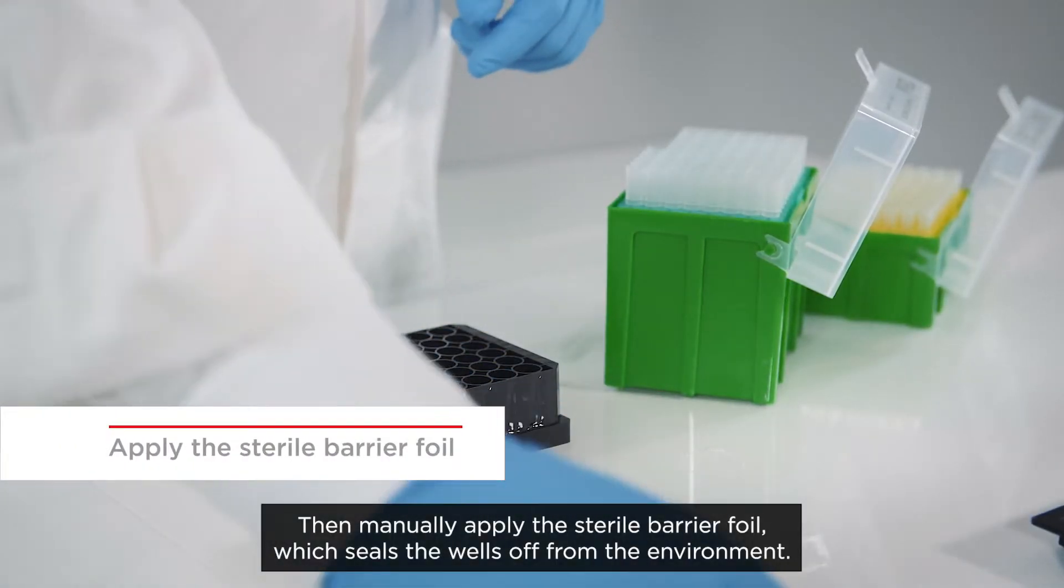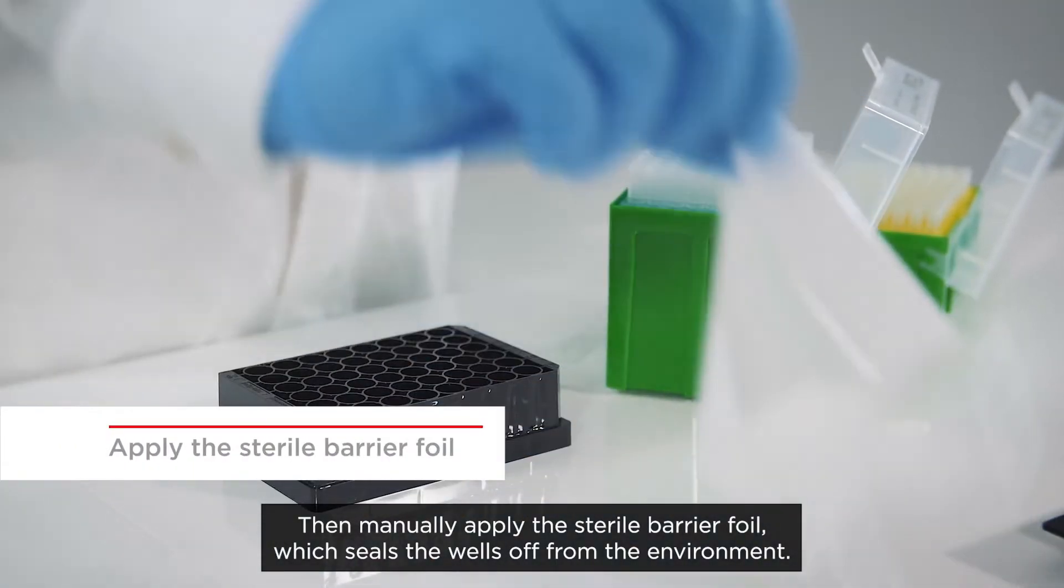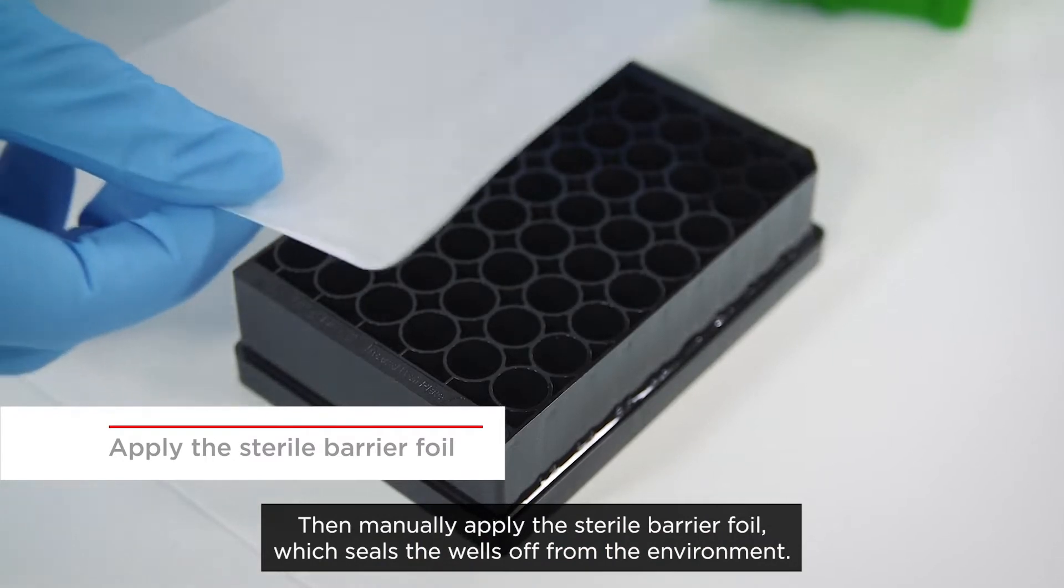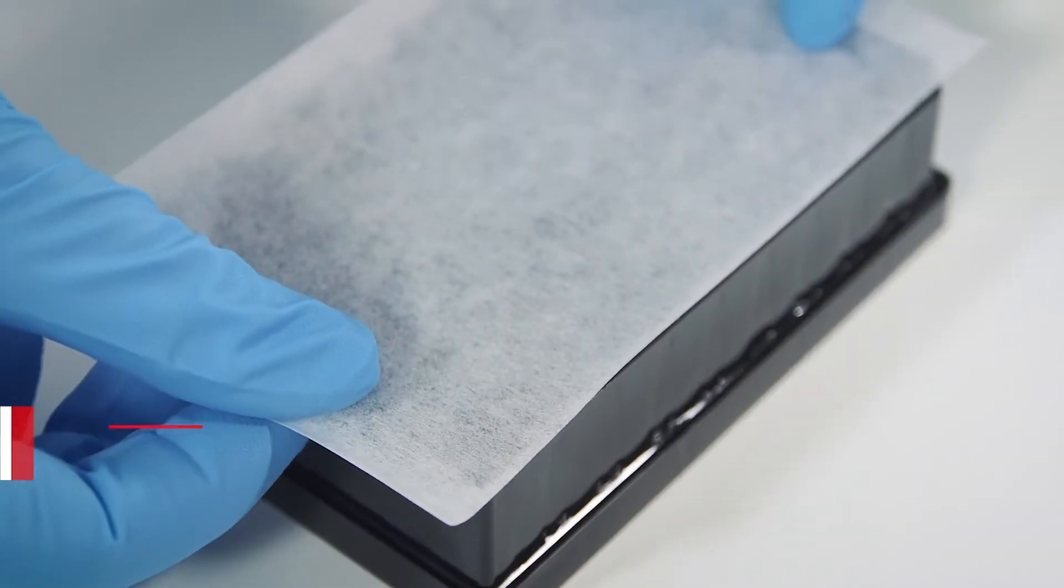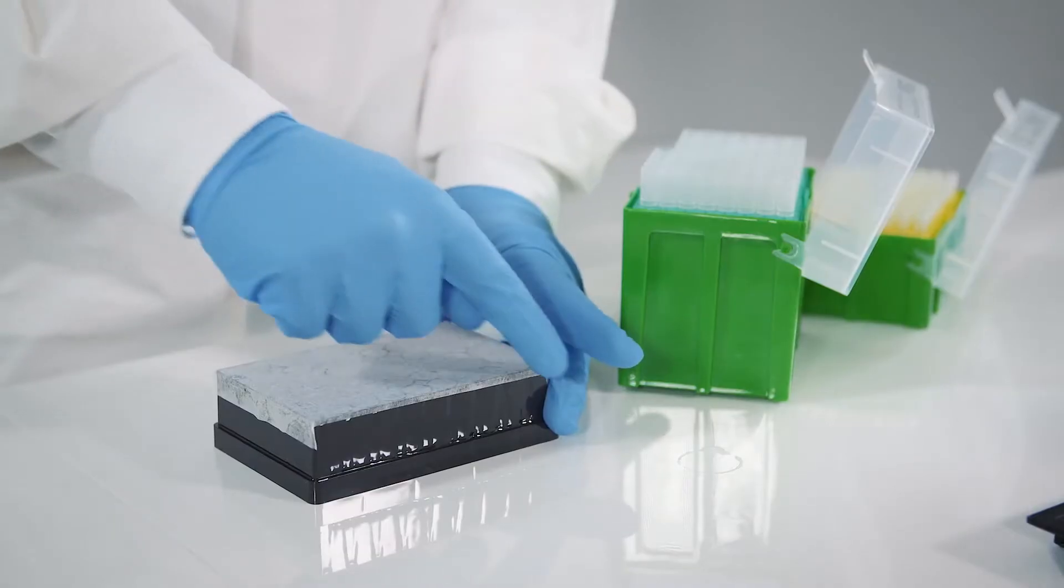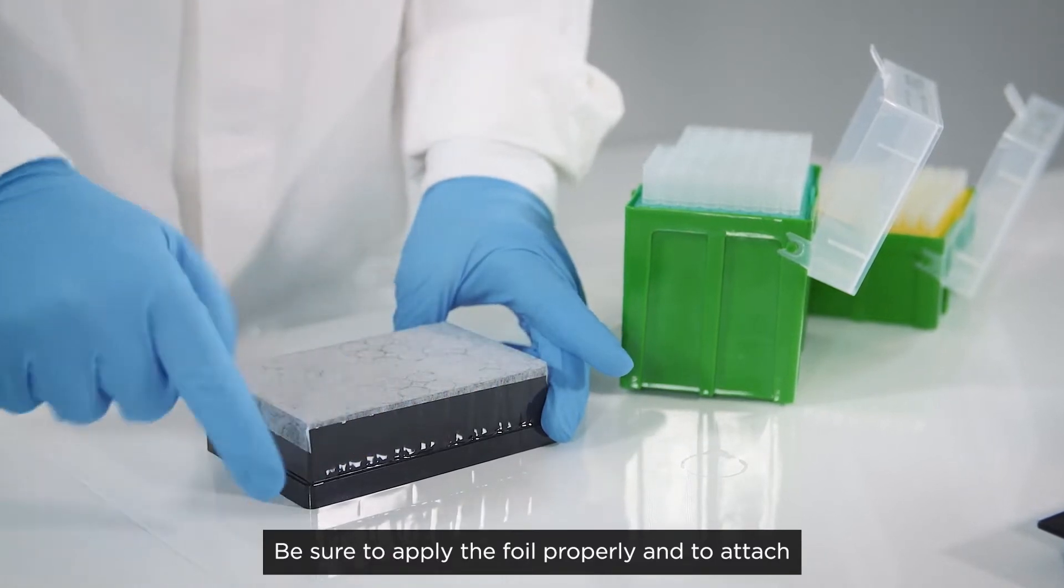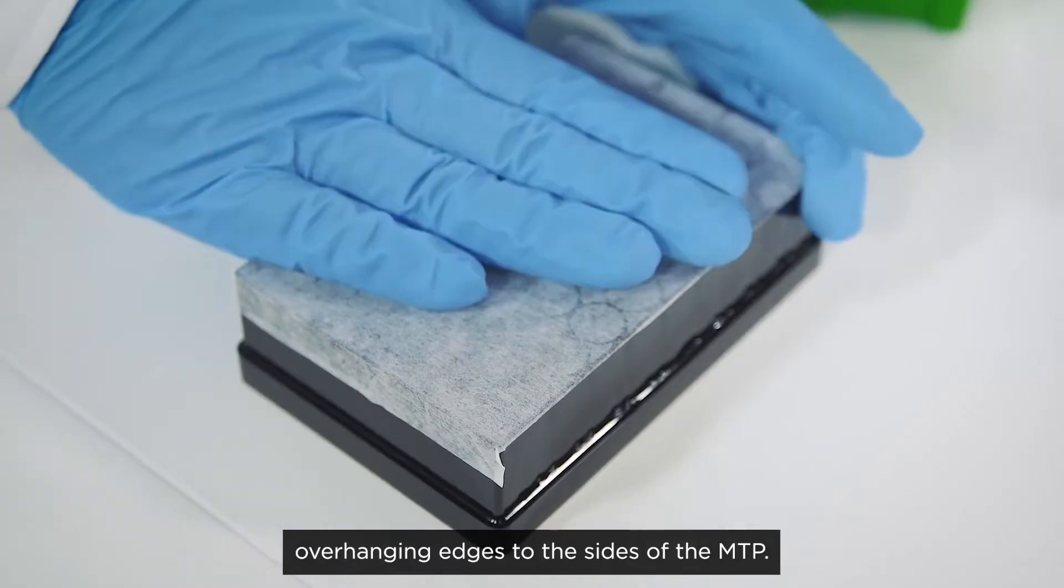Then manually apply the sterile barrier foil, which seals the wells off from the environment. Be sure to apply the foil properly and to attach overhanging edges to the sides of the MTP.